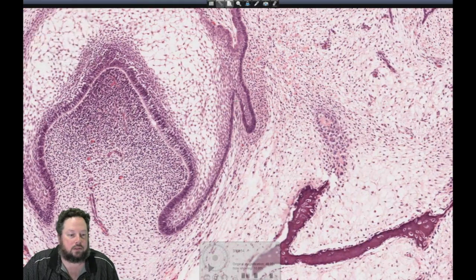So if we can do this. Oh, I've just written in red. Oh, this is really bad. I'm using the mouse here. This is really bad. Odontoblast.